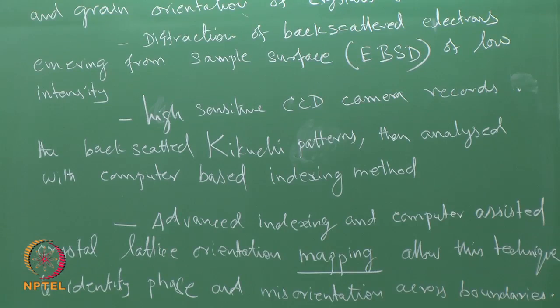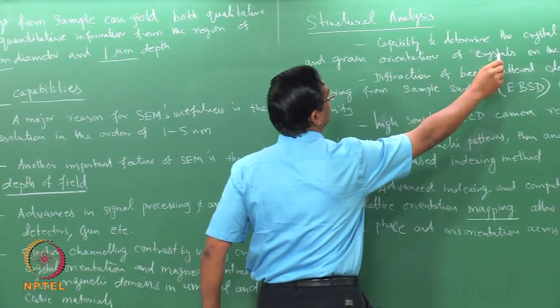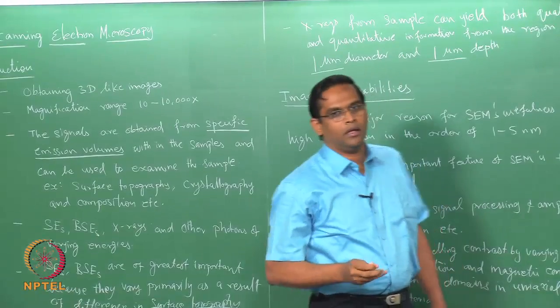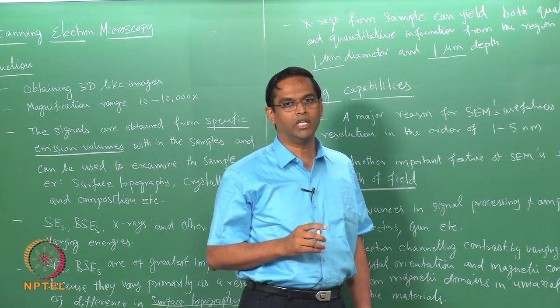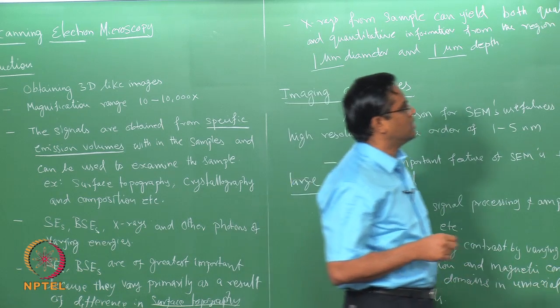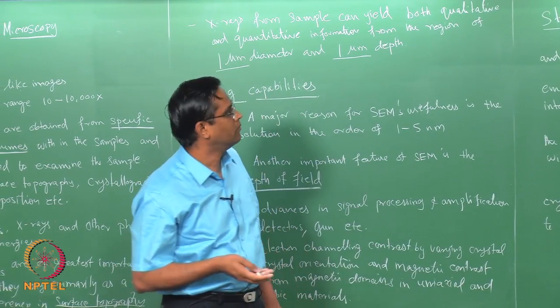Okay. If you look at what structural analysis one can do with this SEM, it has the capability to determine the crystal structure and grain orientation of the crystals on the surface. Please remember that whatever information you obtain is only from the surface, with very limited volume. You will understand that in much more detail as we go through these lectures.